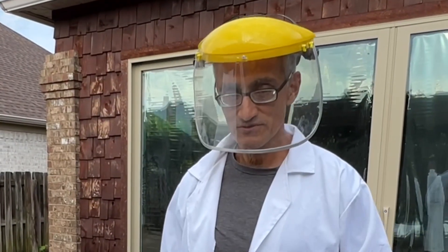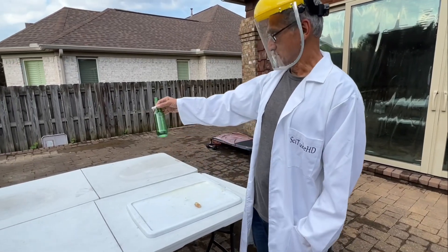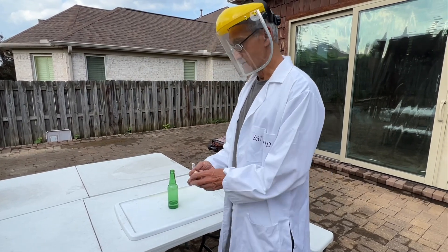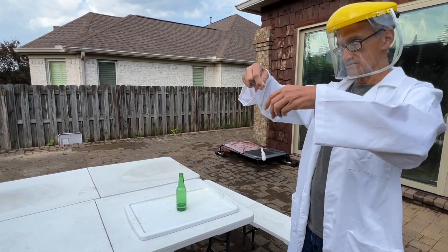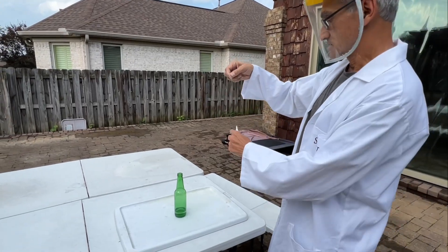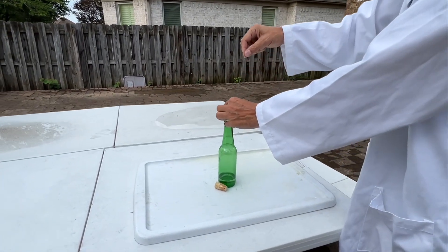Hey folks, today I'm going to do the so-called genie in the bottle experiment. I have a bottle here containing a liquid, and I'll explain what that liquid is later. I actually had a cork but decided I wasn't going to use it. What I'm going to do is drop this in — normally you'd have the cork holding there and pull it out, and it would drop right in. Instead of using the cork, I'm just going to show you directly what it does.